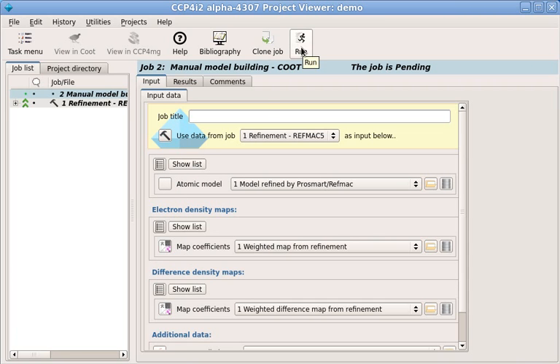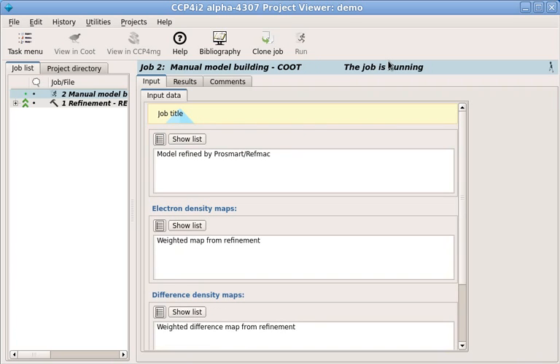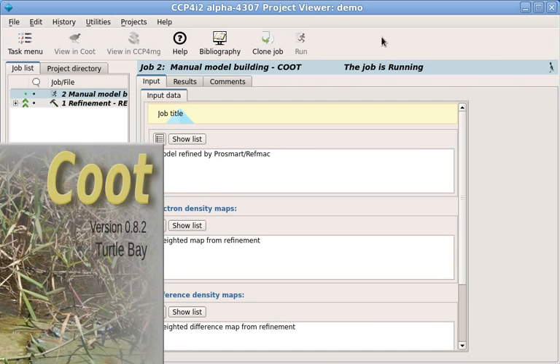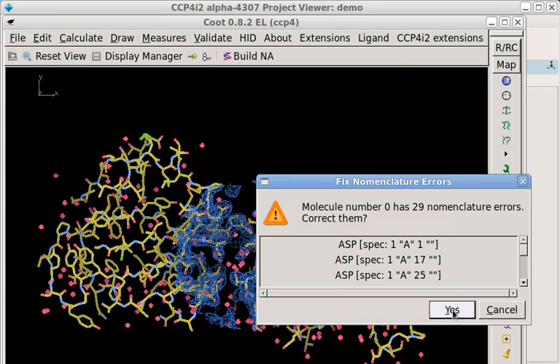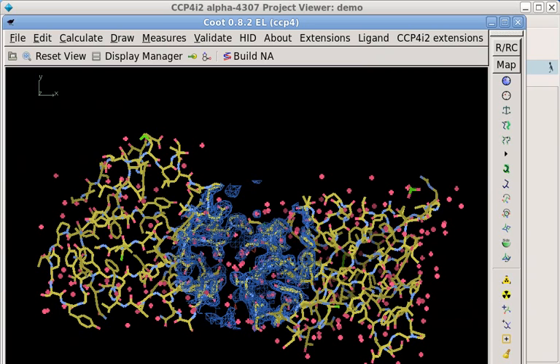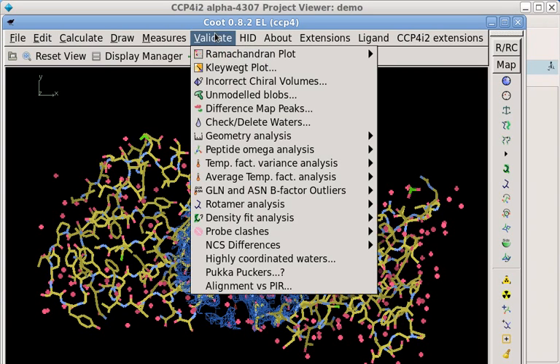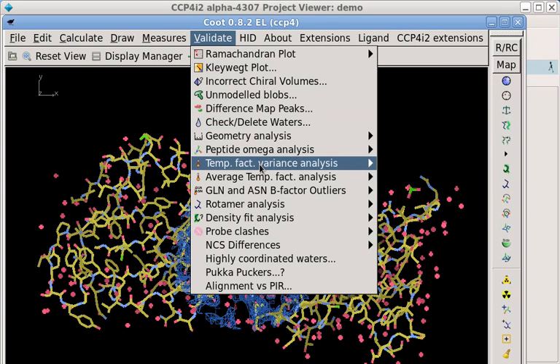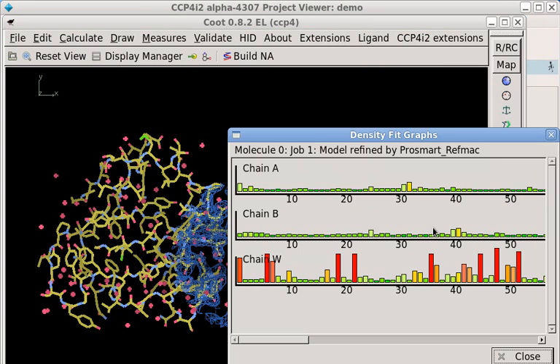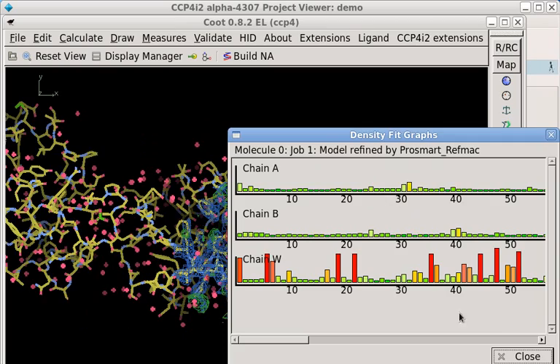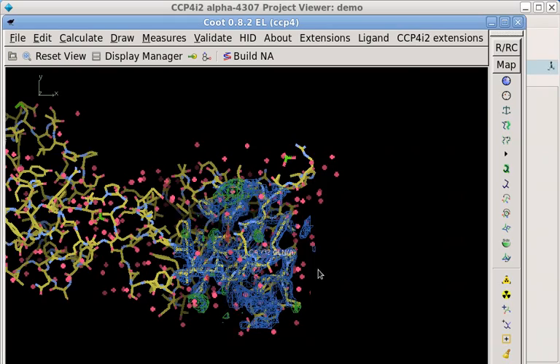In this case, the data are selected automatically, so we'll just click the Run button to start Coot. We'll do some validation and model building as usual in Coot.